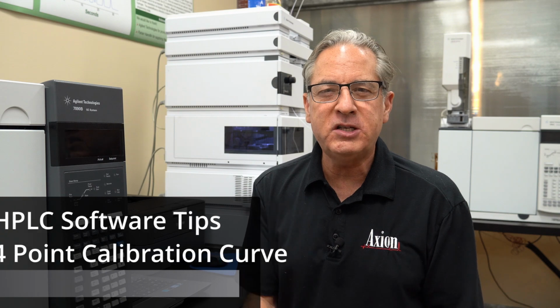So let's talk quantitation. One of the most popular things we do in our LCGC bootcamp is build calibration curves. We do a 4-point external standard for HPLC, and we do a 3-point internal standard for GC, and that gives our participants real hands-on experience in building calibration curves.